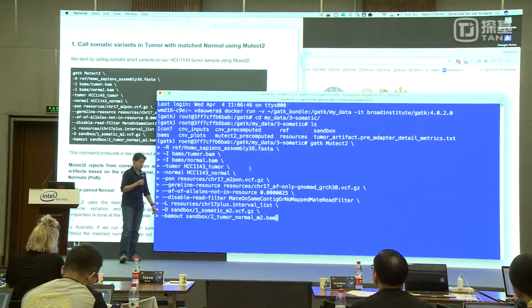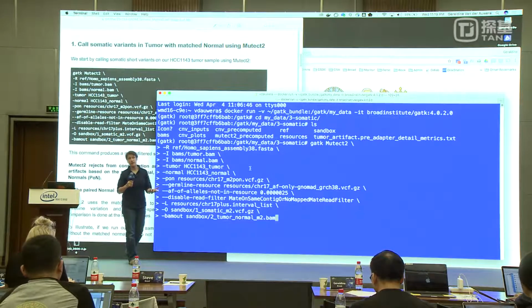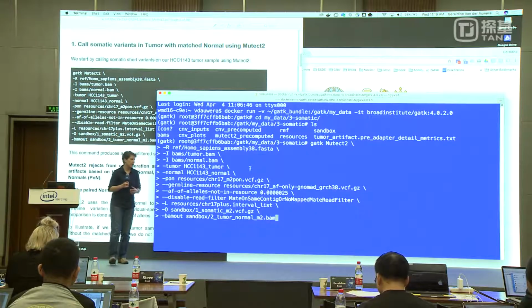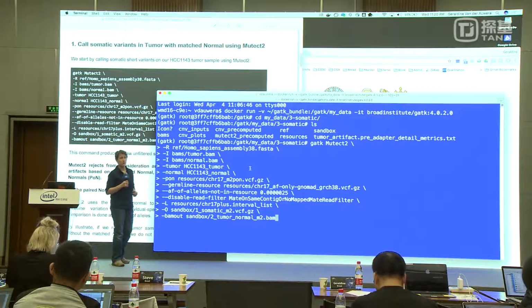And frankly, I would probably recommend doing it because one of the big differences between germline variant discovery and somatic variant discovery is that for short variants, we have pretty good, scalable filtering for germline variants. We get a lot of variants out of an exome or genome, so we can apply statistical clues for filtering.